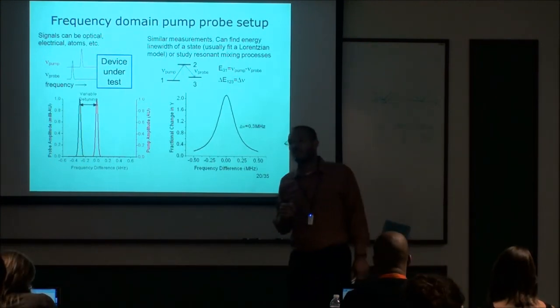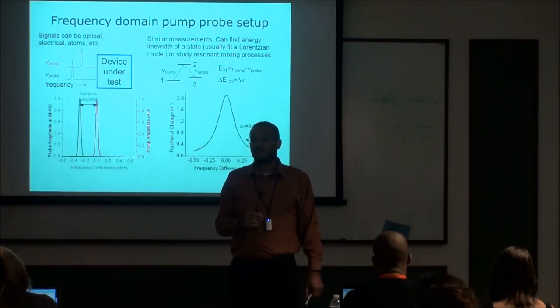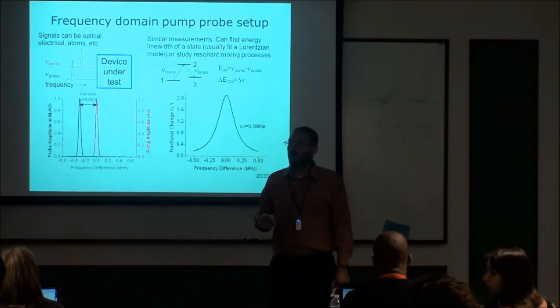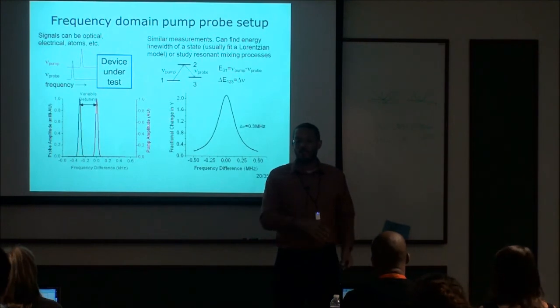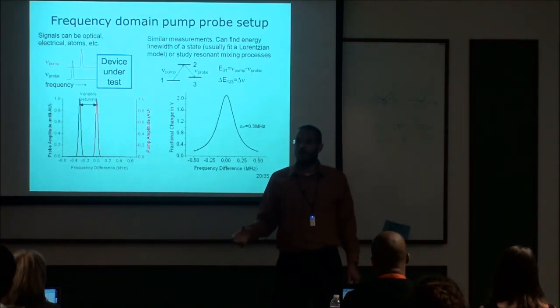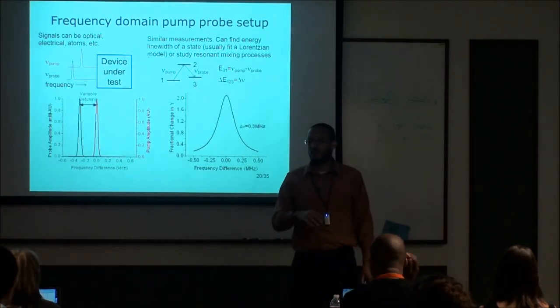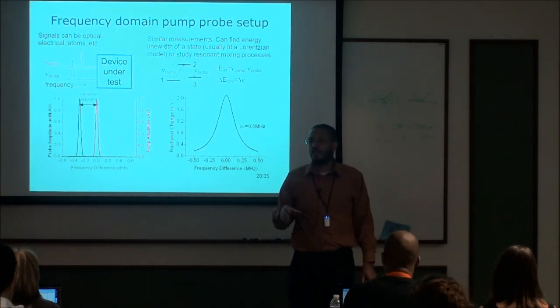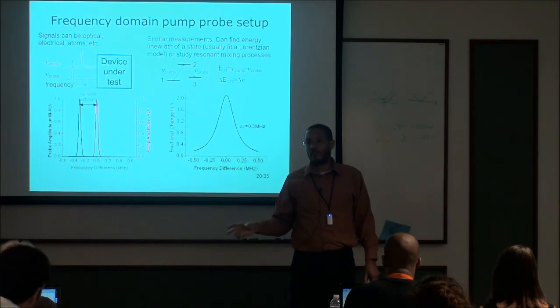Thinking about a white light probe, is it possible to get a particular emission, only a particular wavelength? Yeah, you can use a white light. The common question that I get asked is, instead of a tunable laser, can I just use a white light source and a monochromator? Yes. A white light source plus a monochromator generally gives you the same types of information as a tunable laser. The trade-off is usually that the white light source is not as powerful, so you generally don't get enough signal.